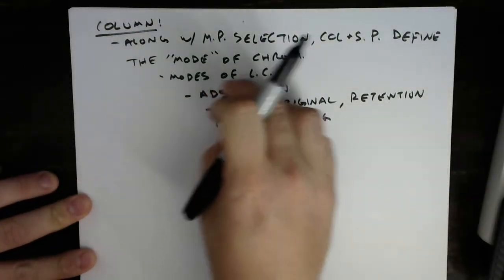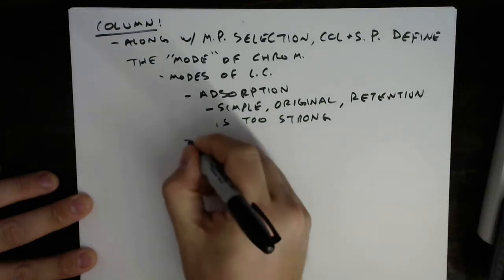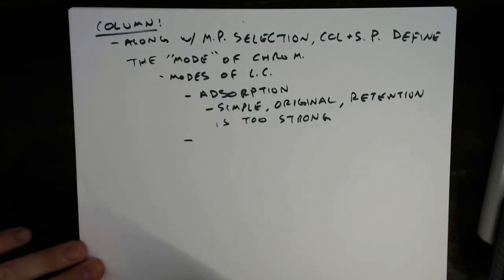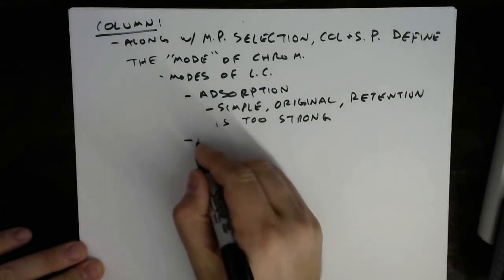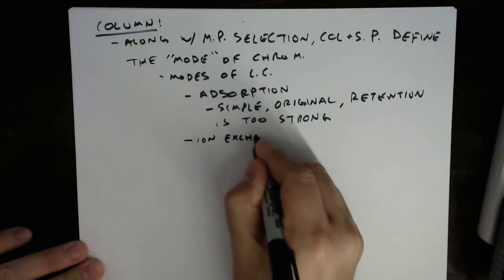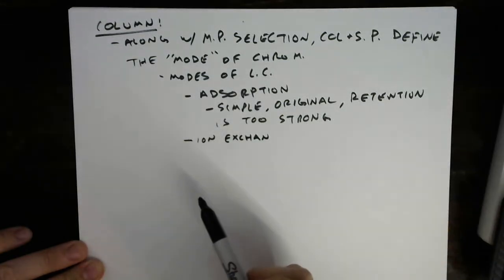But sticking with the concept of interactions that happen right at the surface of the particle and not with these fancy bonded phases, actually, that's probably not an accurate statement to say. You use bonded phase chemistry to produce ion exchange columns, so I don't want to mislead anybody here. But it does remain kind of a direct, a strong intermolecular action, kind of like what you have here.